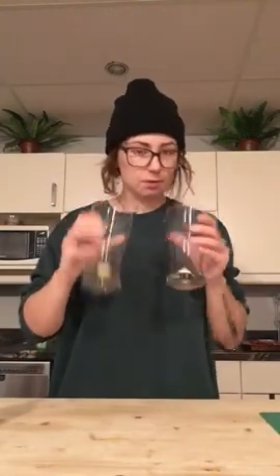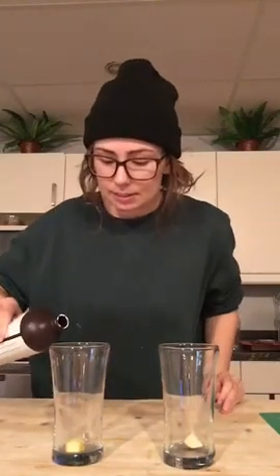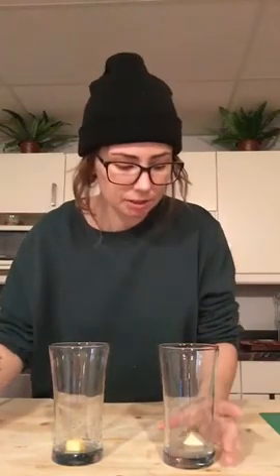Part B. So I have an apple. This one's a potato. So we're going to pour our hydrogen peroxide over these. Let's see how they react. No reaction. So we have a little bit of a reaction within the potato. It's foaming just a little bit, and the apple's like nothing.